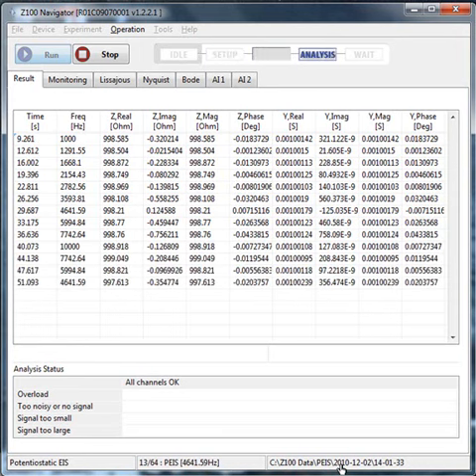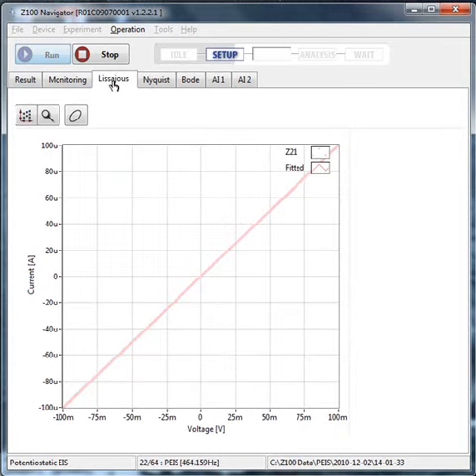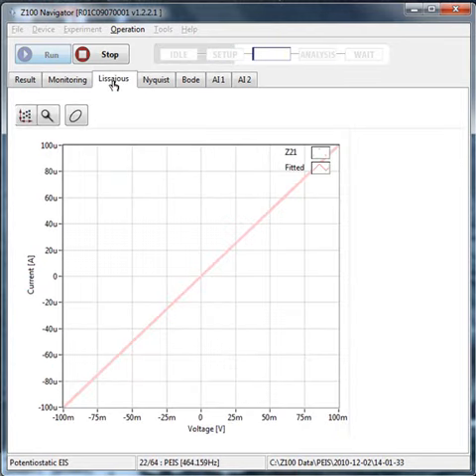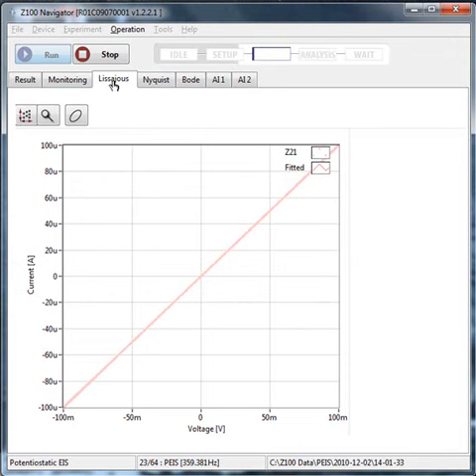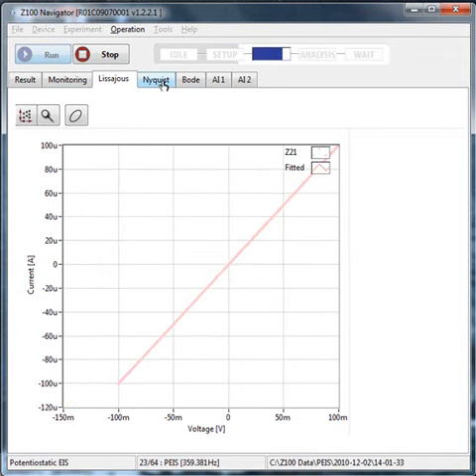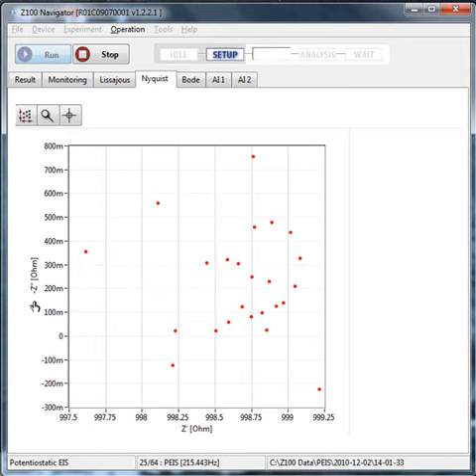Monitoring shows the applied voltage and output currents. Lissageux shows an XY display of the applied voltage and the output current. The Nyquist plot plots the real Z versus the imaginary Z.